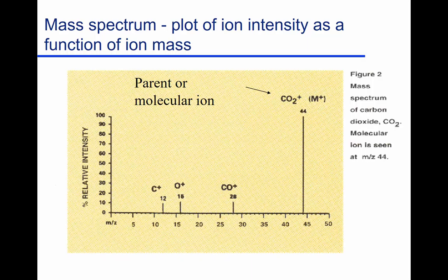I say it blows it to bits. Well, okay, maybe I have to qualify that. It largely blows it into bits. Some of them don't fragment very well. I'll show you some problems where some bonds are so weak, you never see this. So it really depends on the molecule, how cohesive, how strong are those bonds. So is it consistent? It is consistent, and it's always consistent.